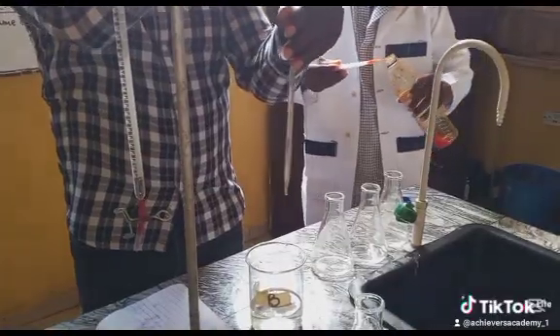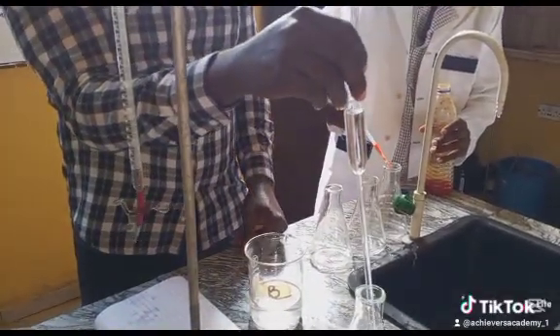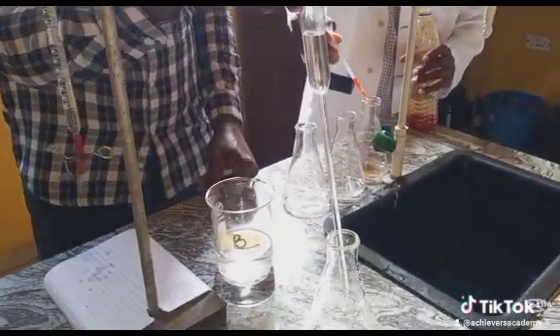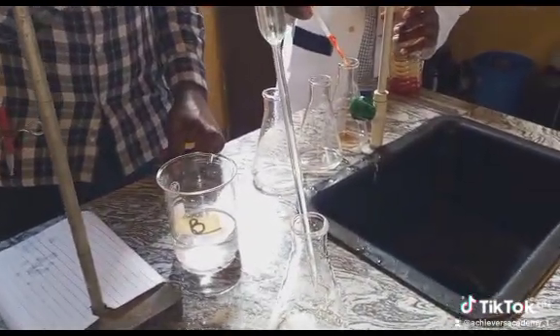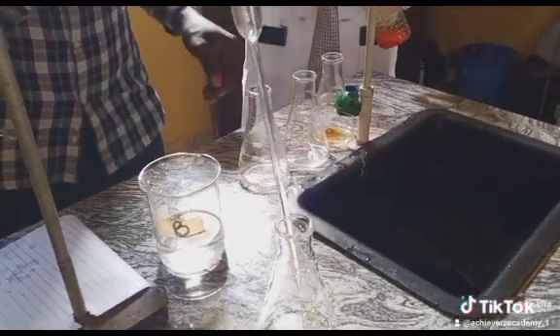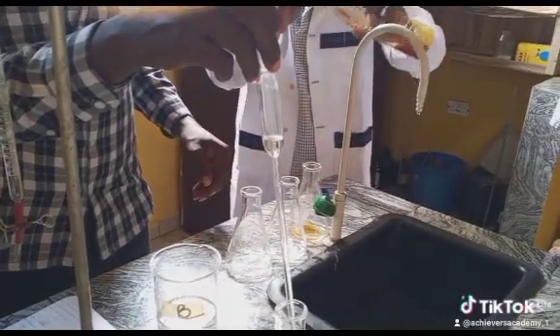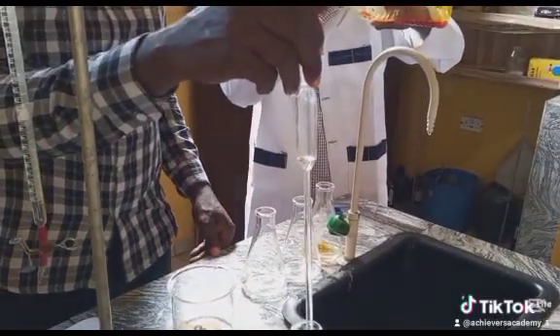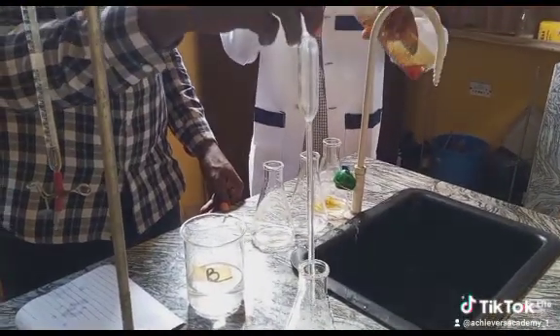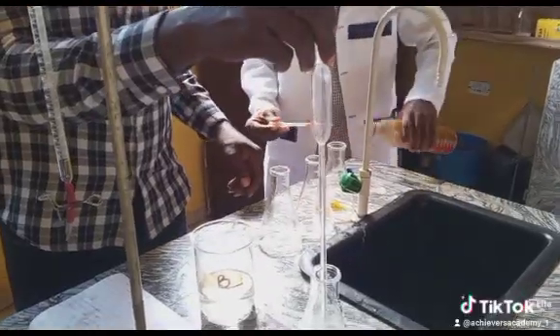Two drops. Apply little pressure, one at a time. Let it not drop on the body. Okay. Shoot it out a little inside there. Let it come close to the tip. There you can pour some methyl orange into the container.